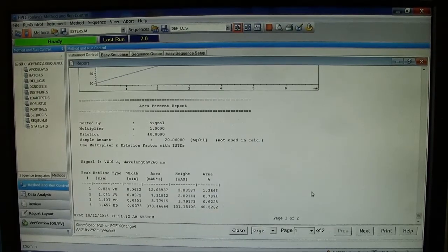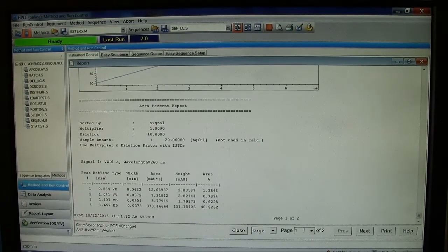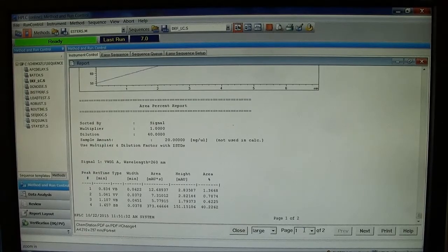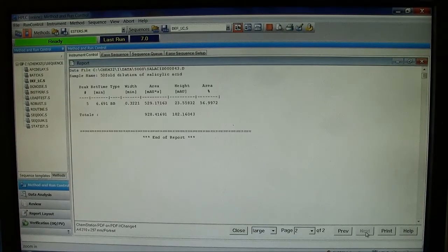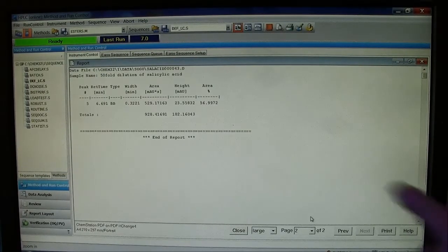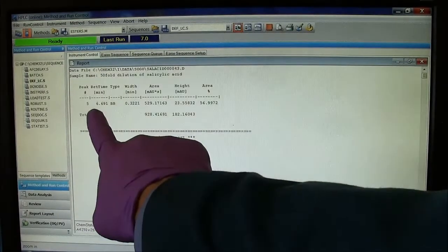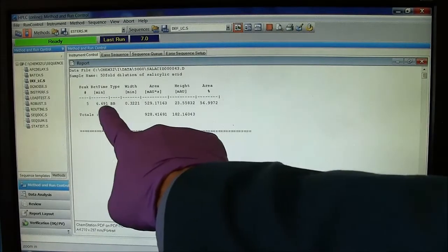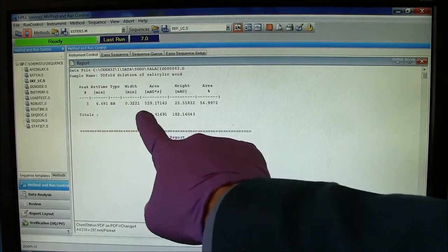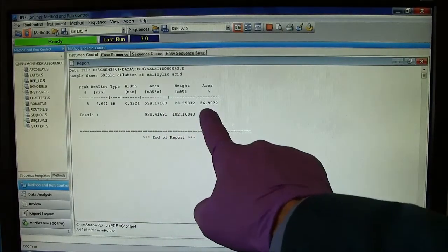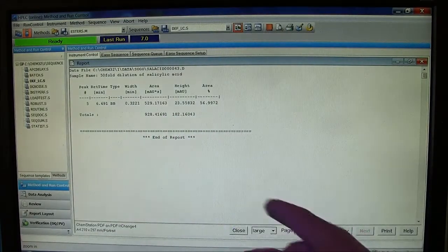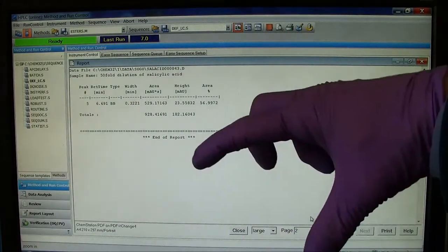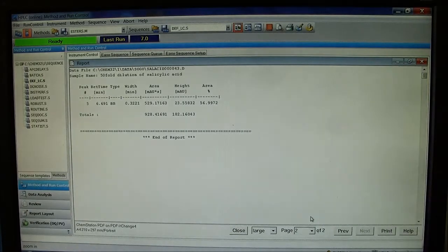There will be a second page that shows the contamination coming out late in the gradient. It's actually a large area, that broad peak there.